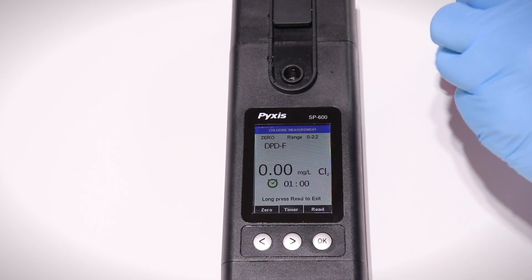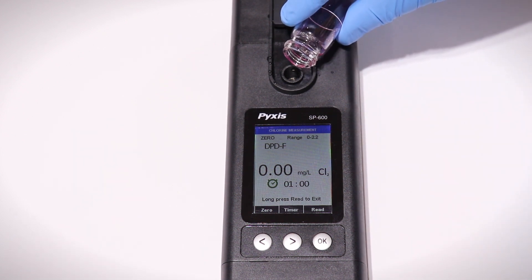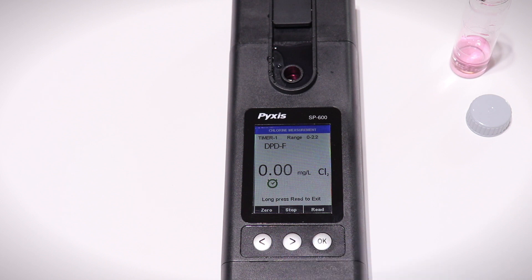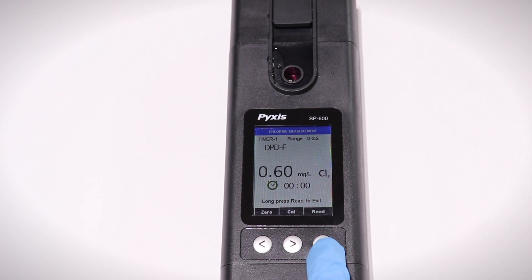Next, insert the reacted sample and press the right arrow button to start the reaction timer. When the timer ends, press the OK button to get a finalized reading.